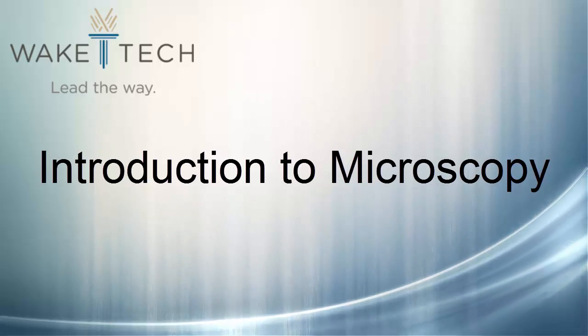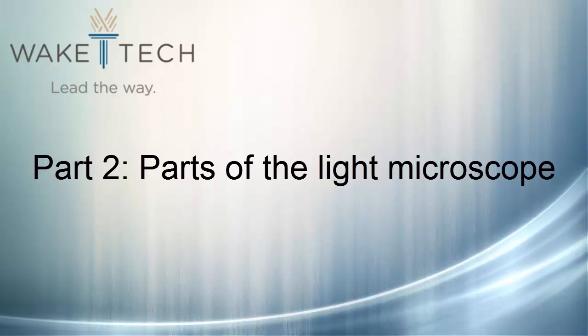Before getting started on your lab activities, you'll need to learn about the major parts of the light microscope.